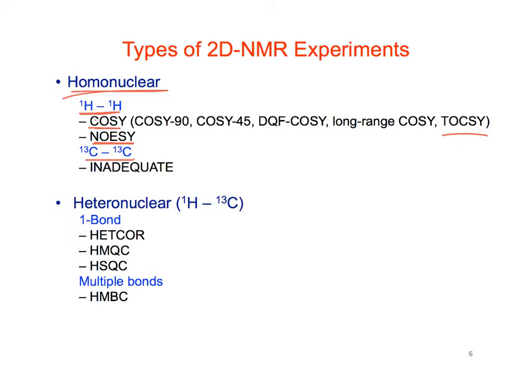All right, and so then there are the heteronuclear experiments. The most common for us would be experiments that show coupling between protons and C13.